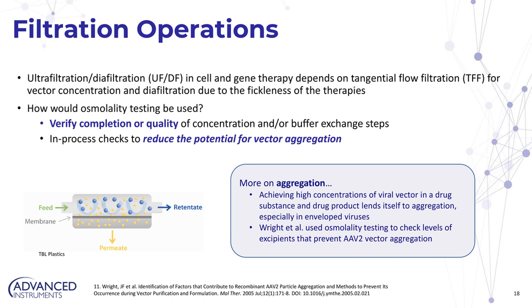The other piece is really interesting, and I wanted to focus a little bit more on this, is the in-process ability of osmolality testing to potentially reduce the potential for vector aggregation. So, of course, ultimately, the goal is to achieve high concentrations of viral vectors in a drug substance and ultimately in a drug product.